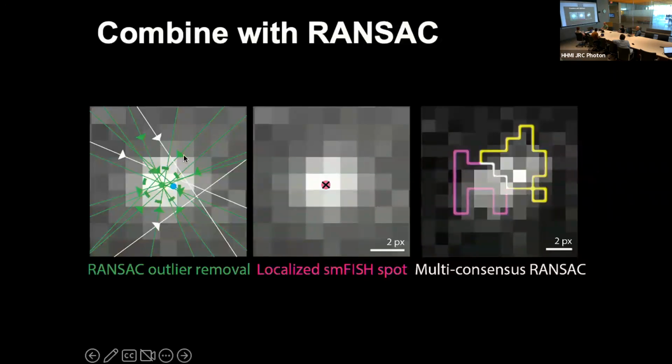And as I said, we combined it with robust outlier removal, where the idea is that you define a certain confidence, that is the green circle, which gives you the radius, saying, please only take gradients that intersect the point and are not further away than half a pixel. This is actually the old picture and it is wrong. This one should be green because it actually goes to the circle. We never changed that. These other two should be white. So the cool thing is that if you sometimes have points that are close to each other, you can actually separate them.